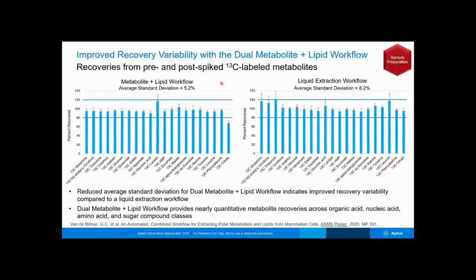Here are the plotted recoveries for the carbon-13 labeled metabolites monitored with this experiment. On the left are results from the dual metabolite plus lipid workflow, and on the right are results from the liquid extraction workflow.